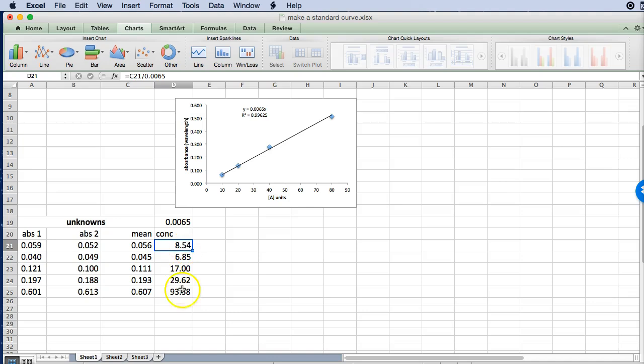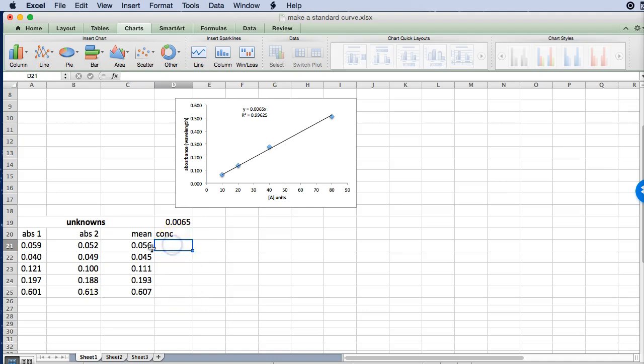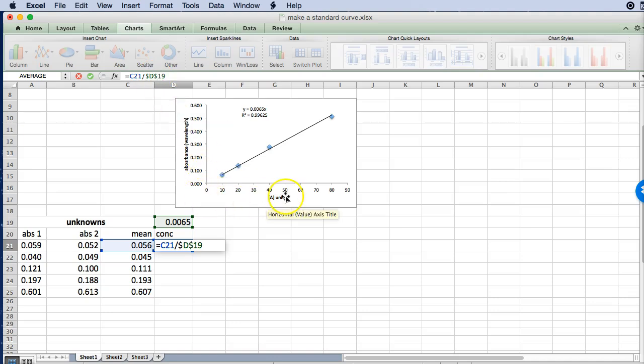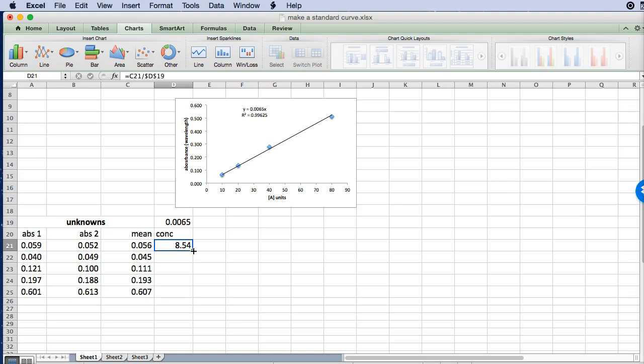So instead of typing these in I'm just going to delete these. You would say we want this cell, we want to divide it by the information in this cell, but we want to keep D19 constant when we drag this down so we have to put a dollar sign in front of D and in front of 19. So that's going to tell Excel that when I drag this formula I want a relative reference here but I'm going to divide by the value in that cell every single time.